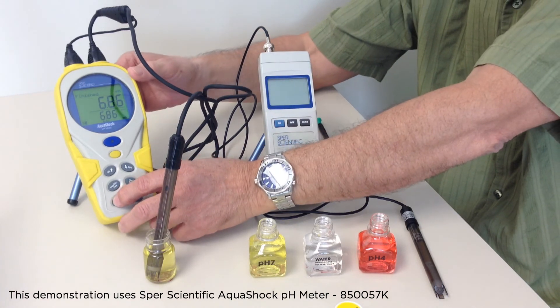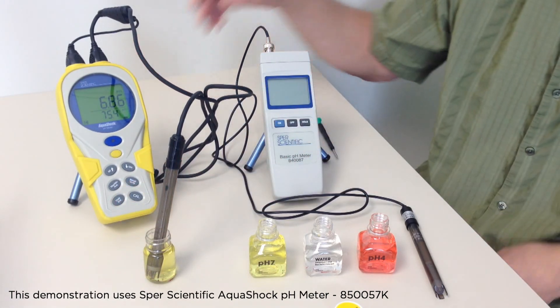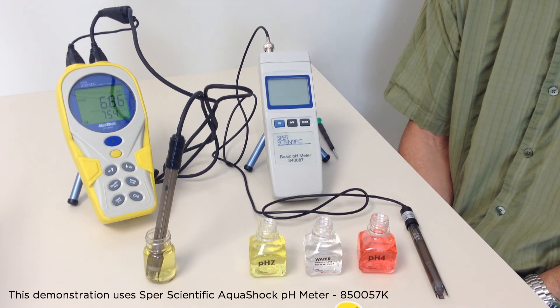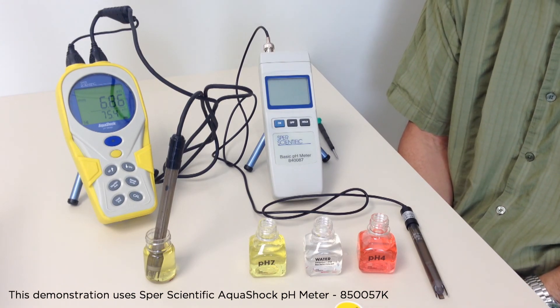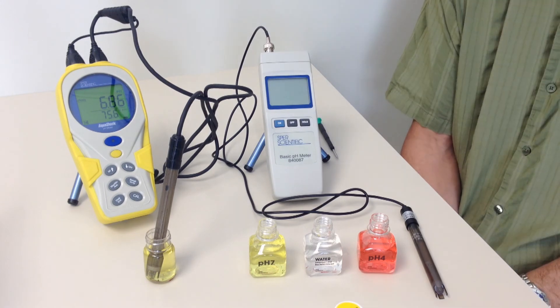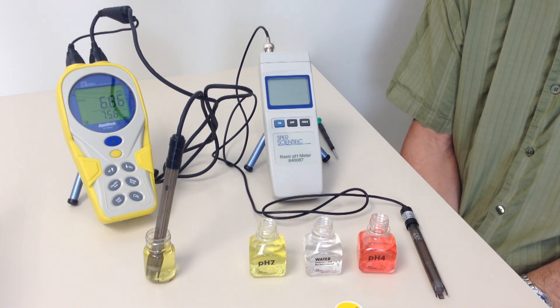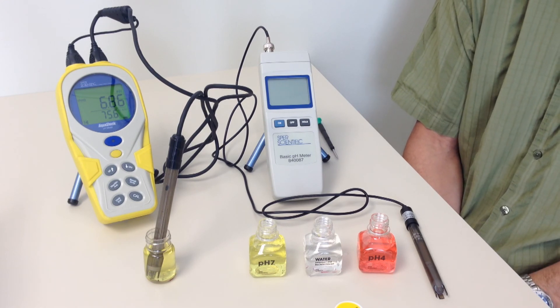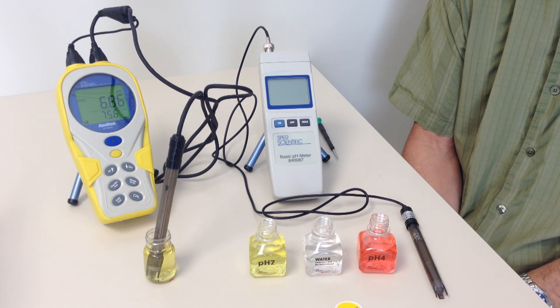We exit and are now in normal mode and can take a measurement. If this were a two-point calibration, we would simply repeat the process in pH 4. The exact menu sequence and buttons you'll need to push will vary from meter to meter, but the principles of pH calibration I've just described will remain true.